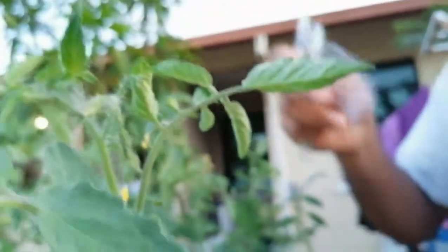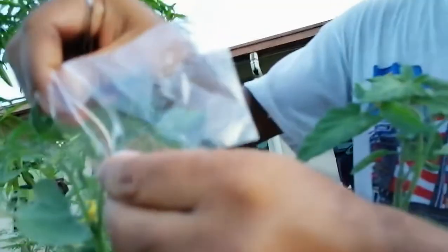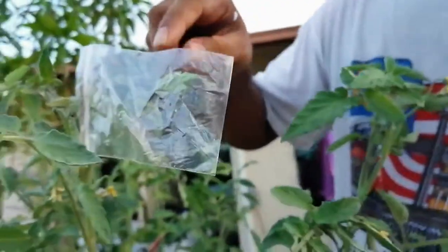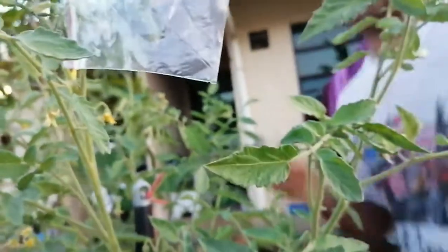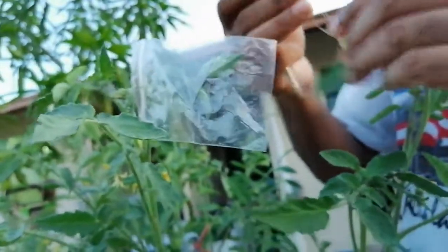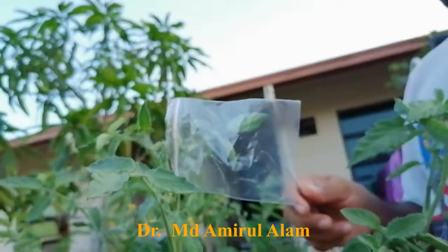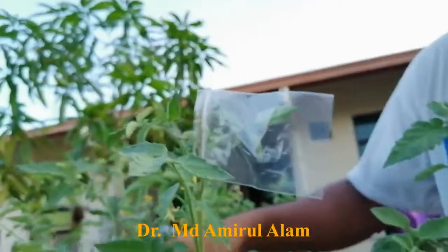After emasculation, we'll do the pollination tomorrow. Today we cover with a zip-lock bag — this is the bagging step. You just keep the flower inside like this. After tomorrow when we do the pollination, we have to hang a tag. This is the emasculation and pollination process in tomato.